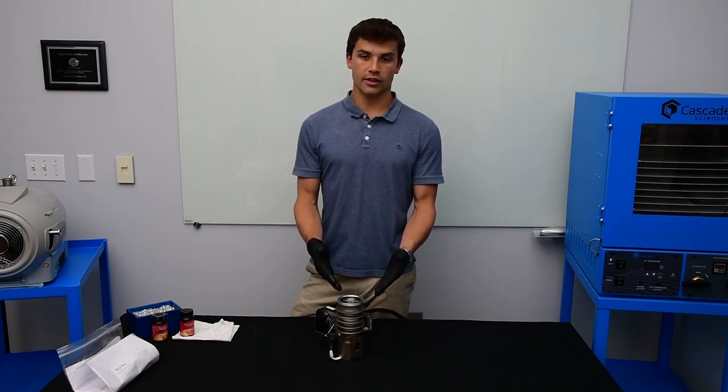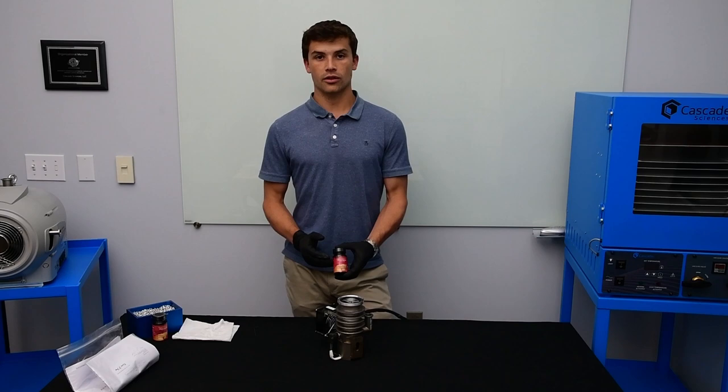Since we're running a 100 millitorr inlet pressure, we're using the higher wattage heaters, and to pair with those heaters we're going to be using the Sanivac 5 pump oil.